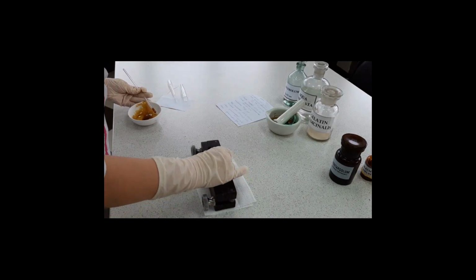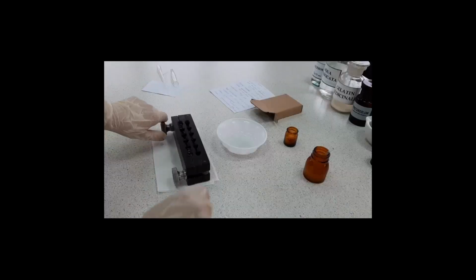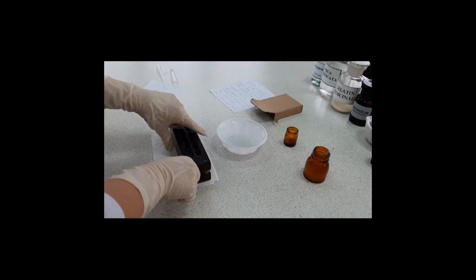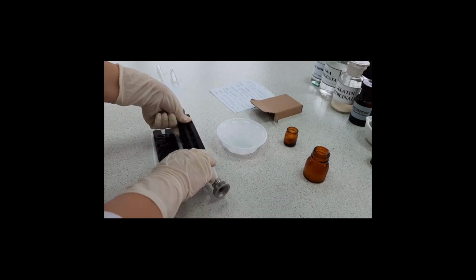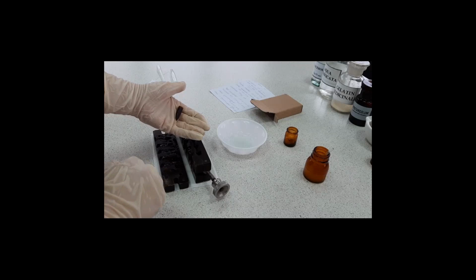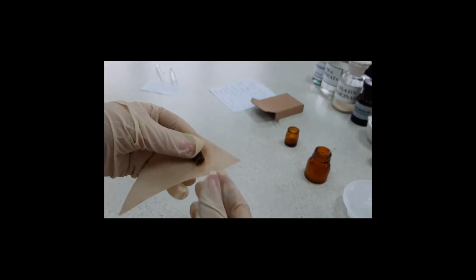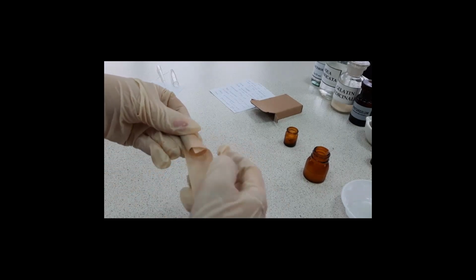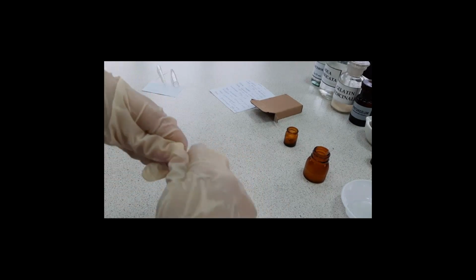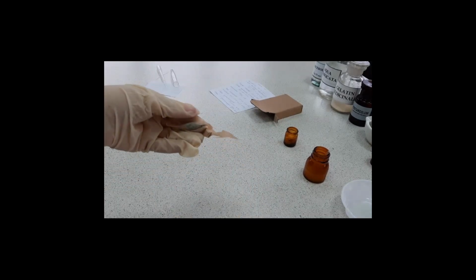Place the filled mold in the fridge for 15 to 20 minutes to completely solidify. After cooling, remove the mold from the fridge, disassemble it, and carefully remove the pessaries. Put the finished vaginal suppositories in a handkerchief of parchment paper, forming a cone. The excess is cut off.